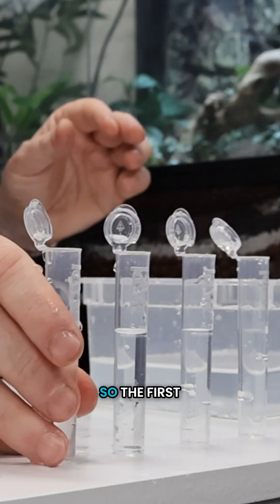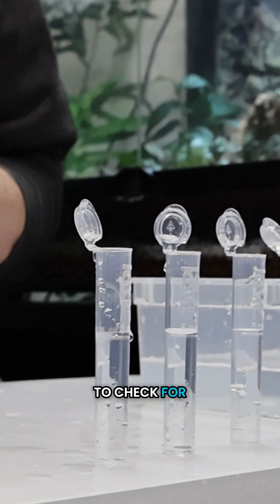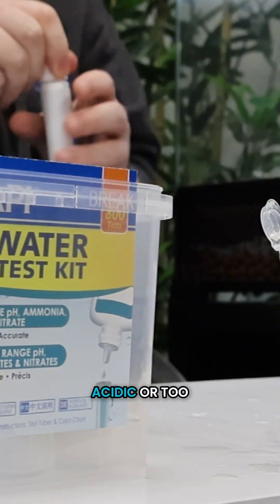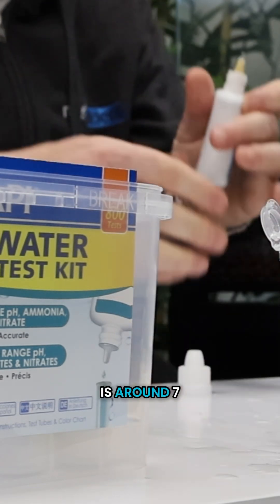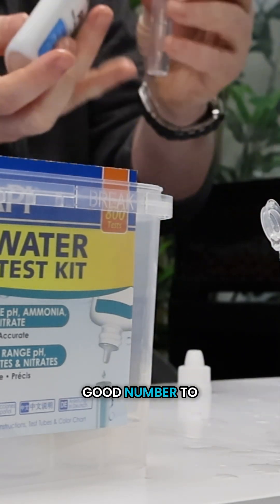The first parameter I'm going to check for is the pH. The water doesn't want to be too acid or too alkaline. A neutral pH is around seven—seven is a good number to aim for.